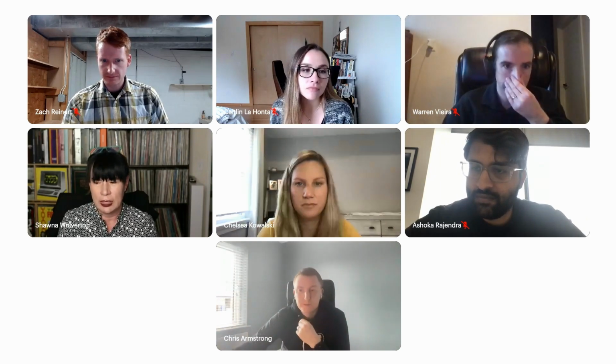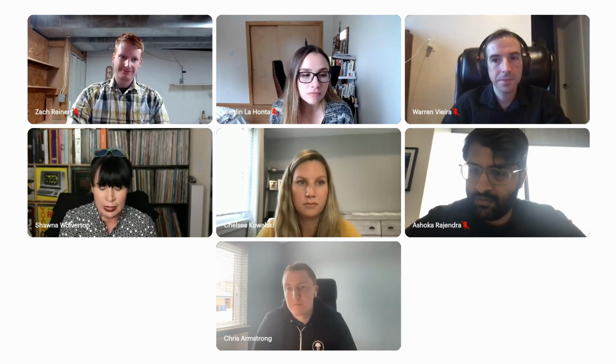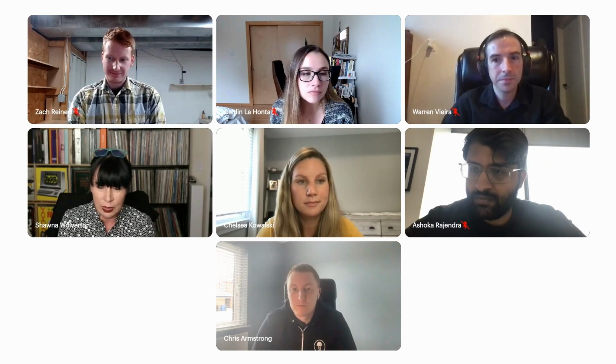And then the next sort of upvoted question here, I think this one probably is for you, Chris, about bringing an outside collaborator using Overwatch or the studies functionality and bring that together with someone who's using Benchling R&D Cloud.